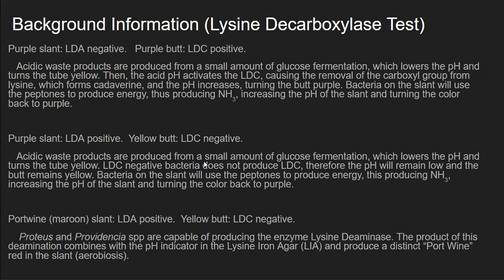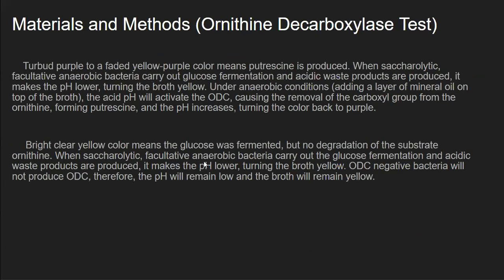Aerobiosis. But the materials and methods, this is the background information for the ornithine decarboxylase test.